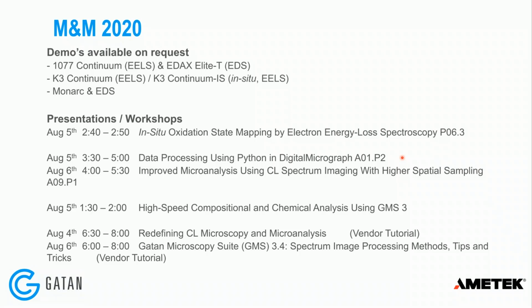So also, one of our participants was asking about looking at momentum resolved EELS, so omega Q EELS. Is that something that we can support on this? So the short answer is yes, but can you elaborate on that, Liam? Yeah, it is something that we can support. And it's actually not too different from the regular K3 alignment.